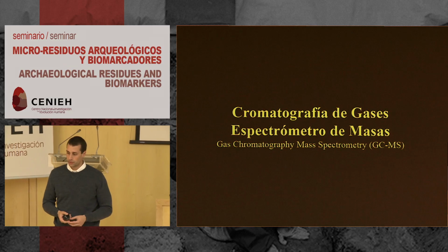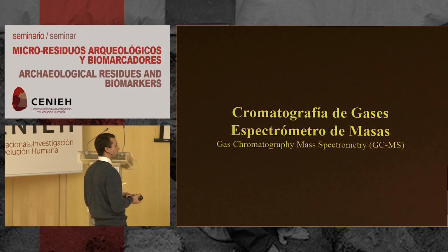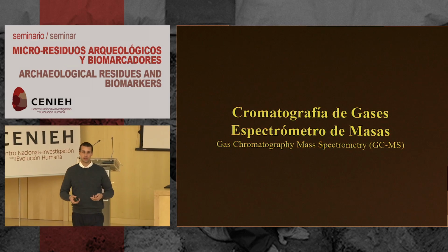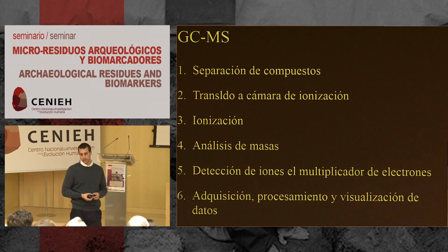Okay, so gas chromatography, mass spec. Most of you are probably familiar with this technique and why it's important for analytical chemistry. Whether or not you're a chemist, it is really great for a lot of the sciences. And it's really broken down into 6 steps.